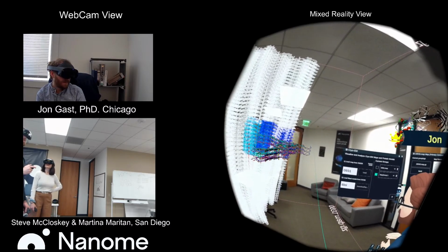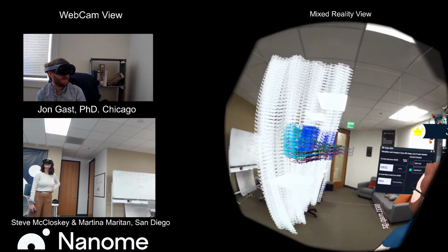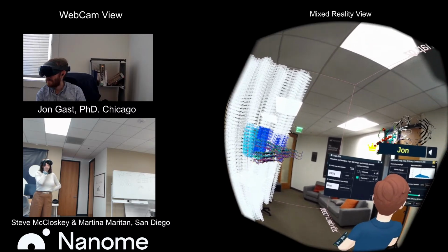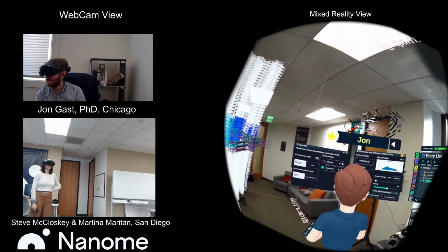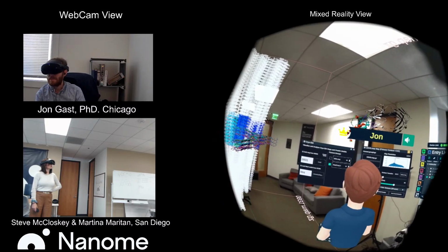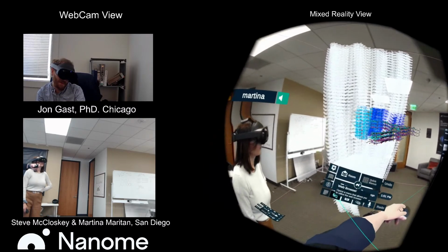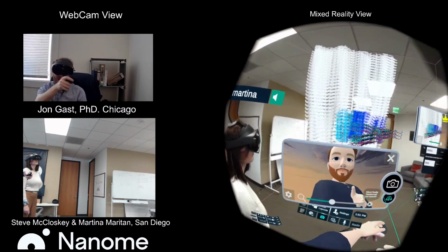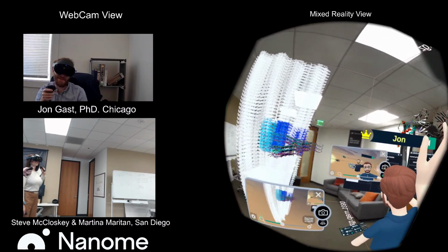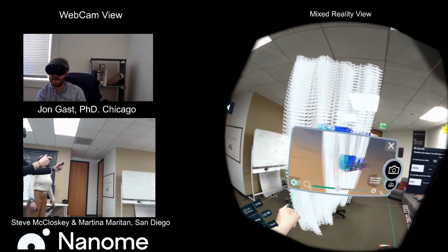So last question here. We keep getting last minute questions, so this will probably be the last one. We have, can the viewport editor be used to compare different regions of the map? And lastly, can we use this to generate images for publications? So images for publications, absolutely. There's a delightful camera feature right here, and we can even flip it around in case we want to say hi to everybody.